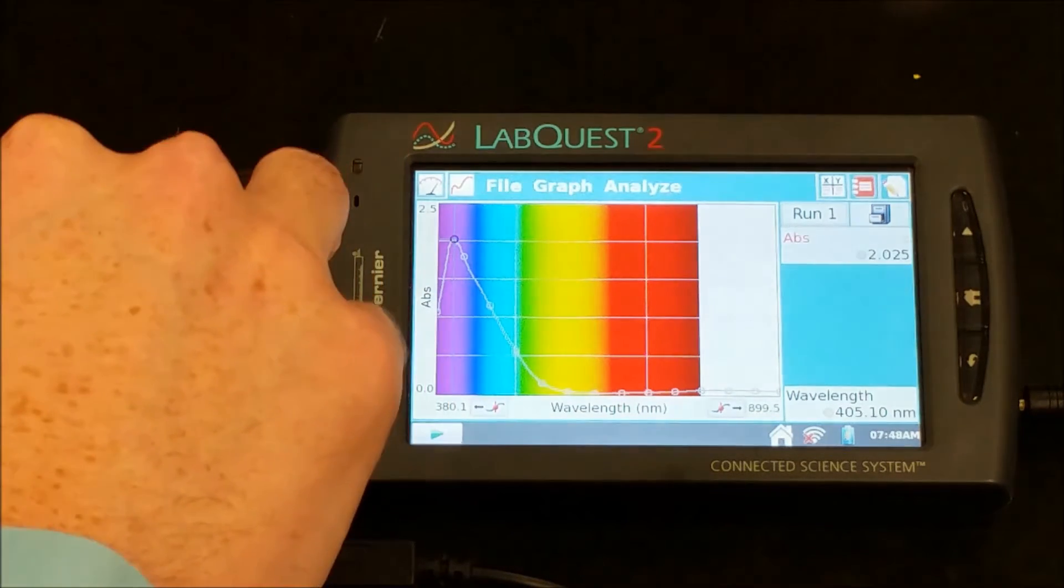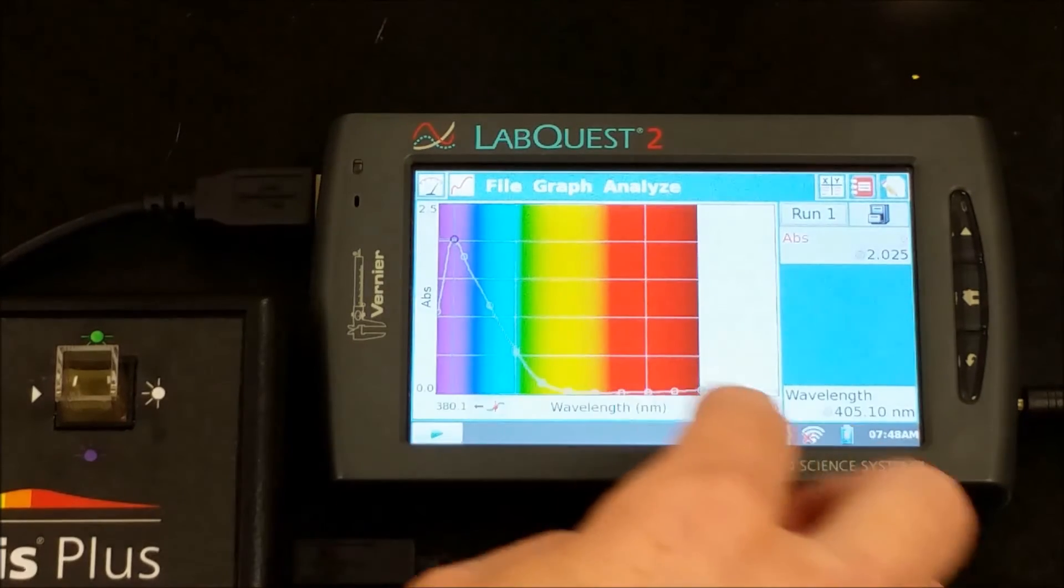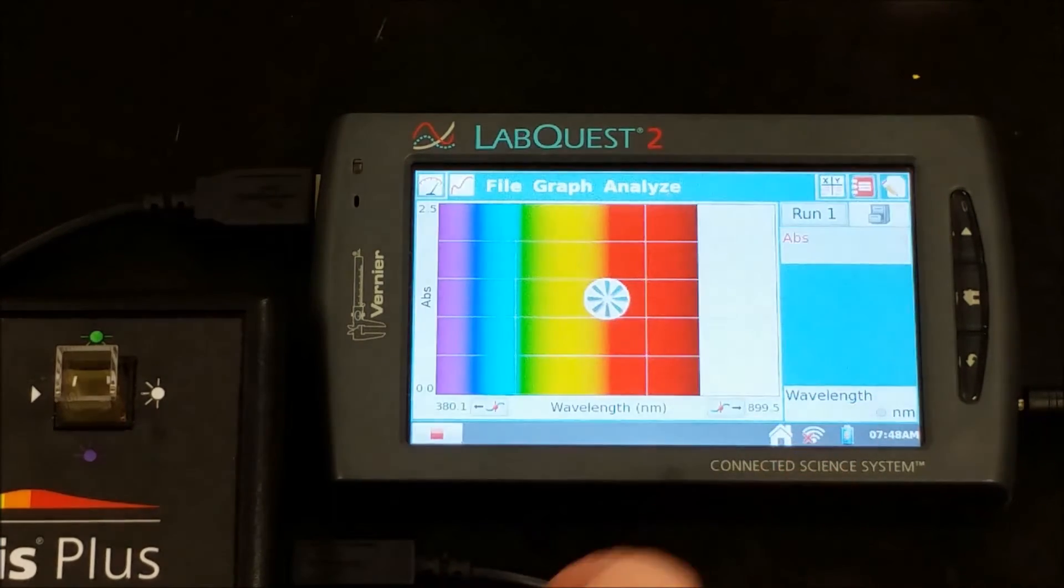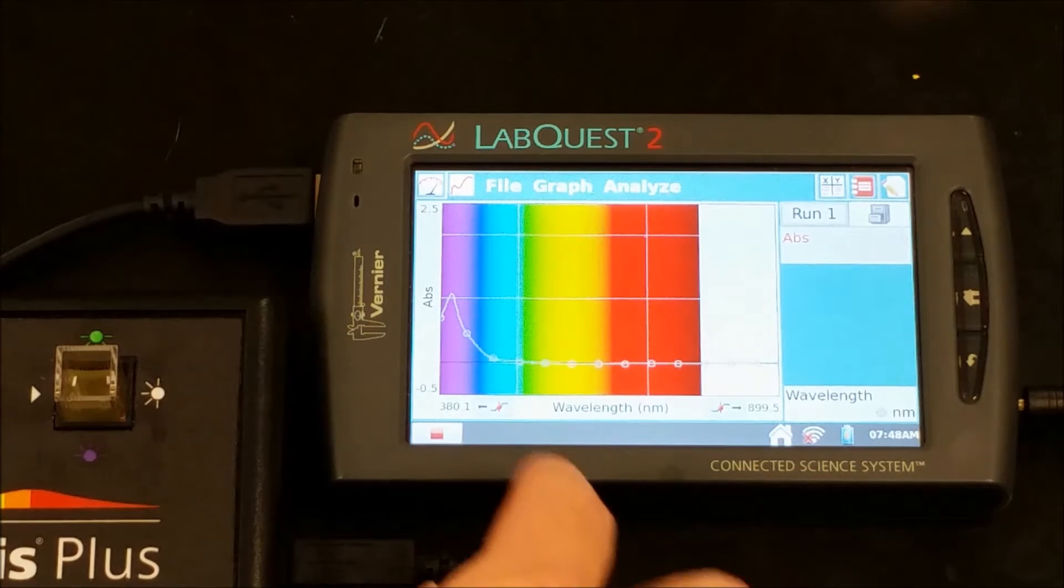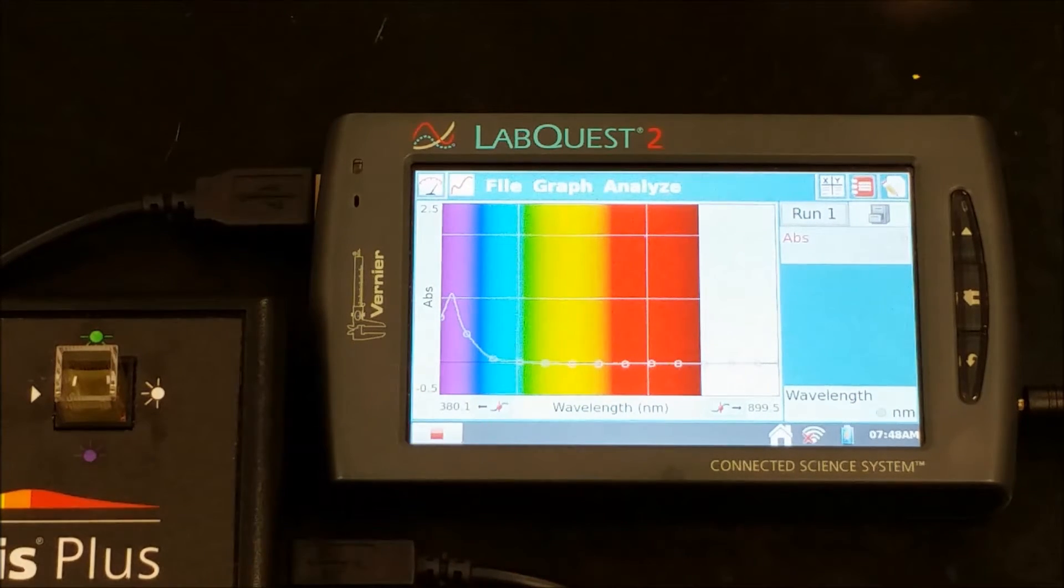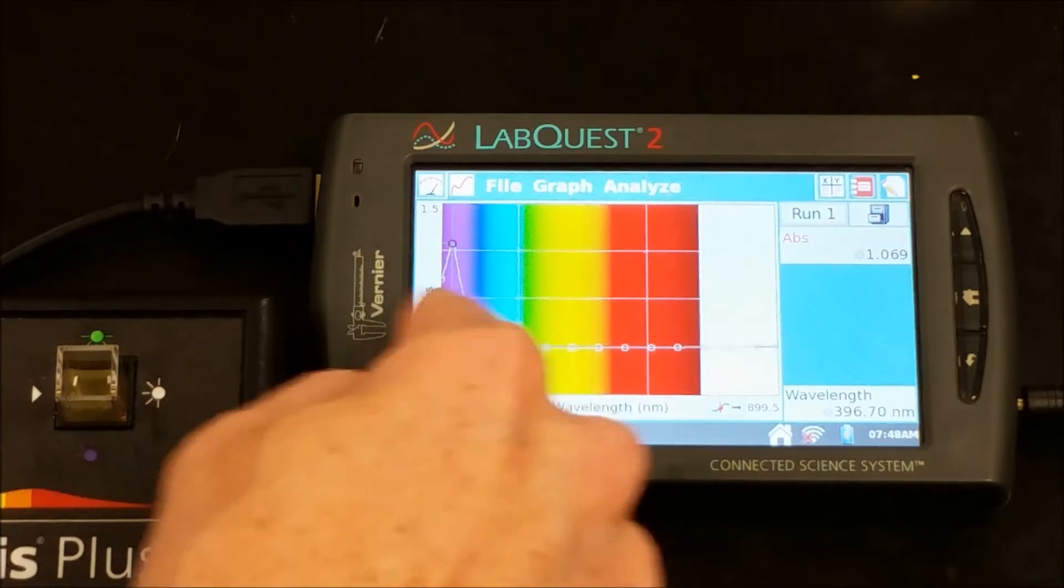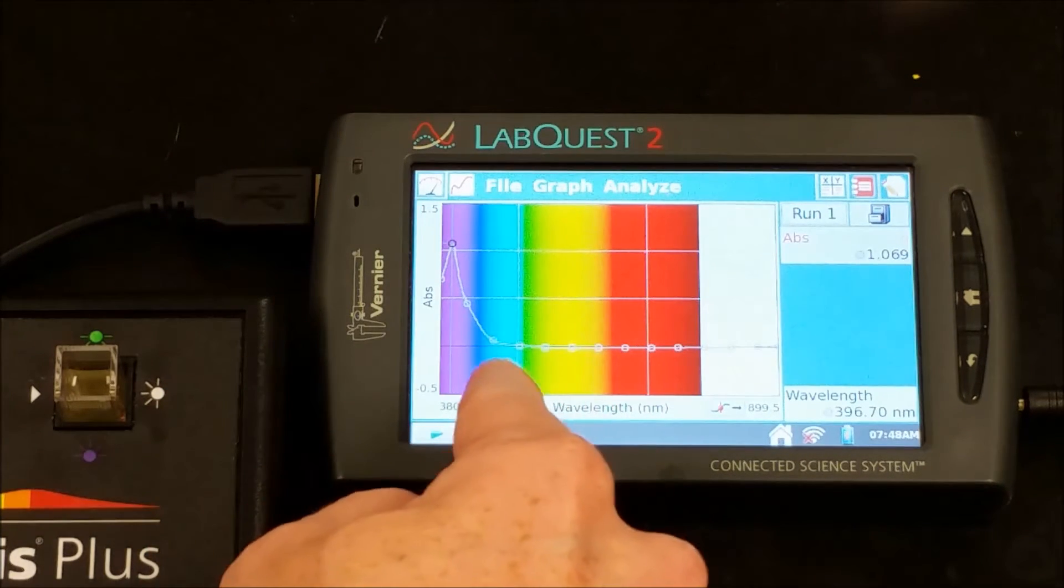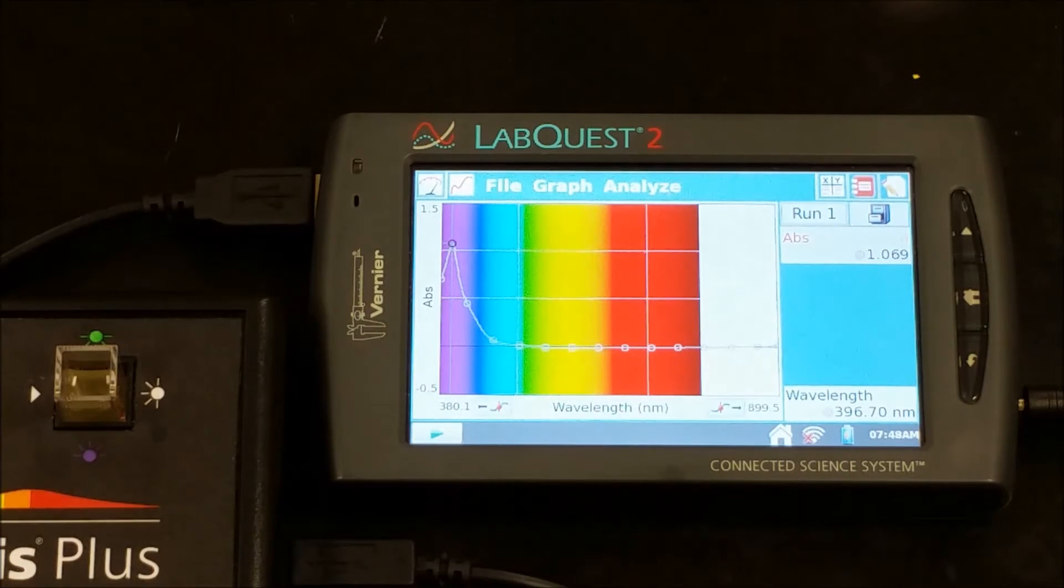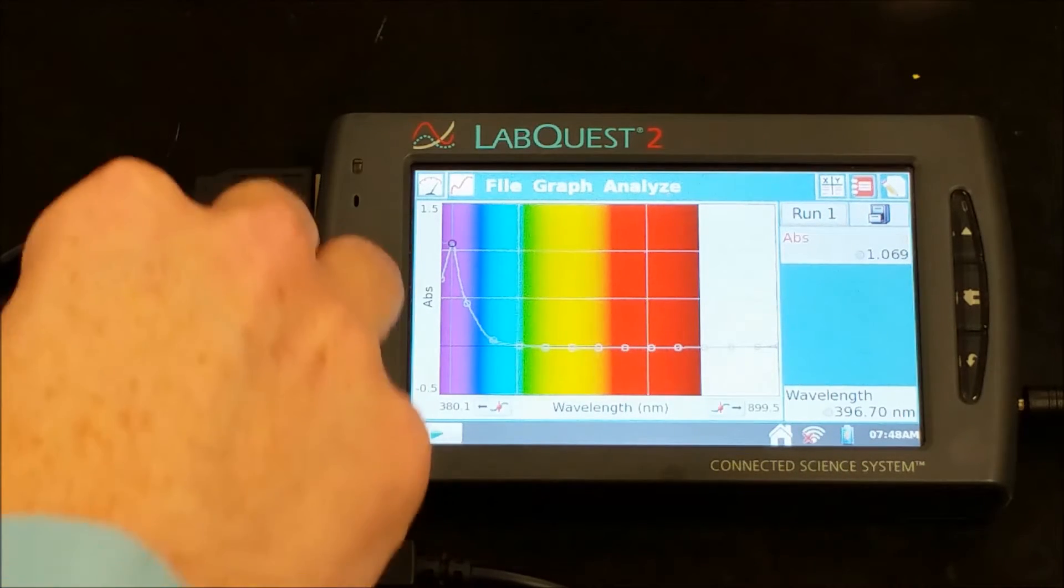We'll take that out and put yellow in. For yellow, this is a little more dilute, so we'll hit stop so we can see it better. We're seeing again a lot of purple being absorbed, some blue, and then really not much of anything else is being absorbed. Everything else is being transmitted through the solution.